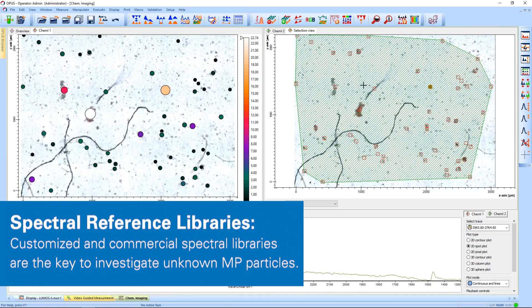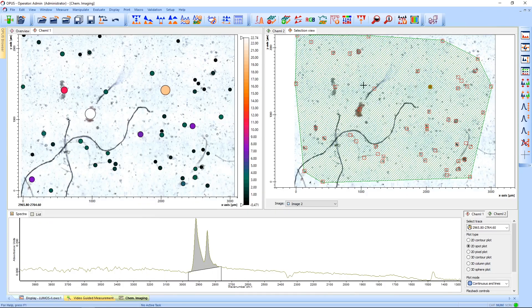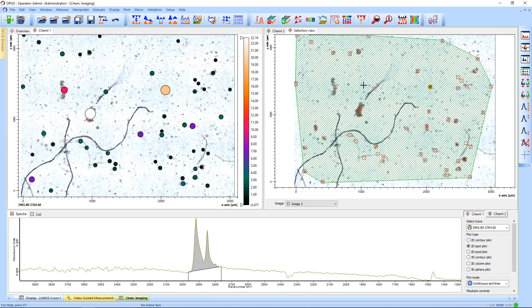Now, if we were to do this for all the particles that are on here, it would be quite time consuming. This is why we developed MPID, an automated evaluation routine for particle statistics.